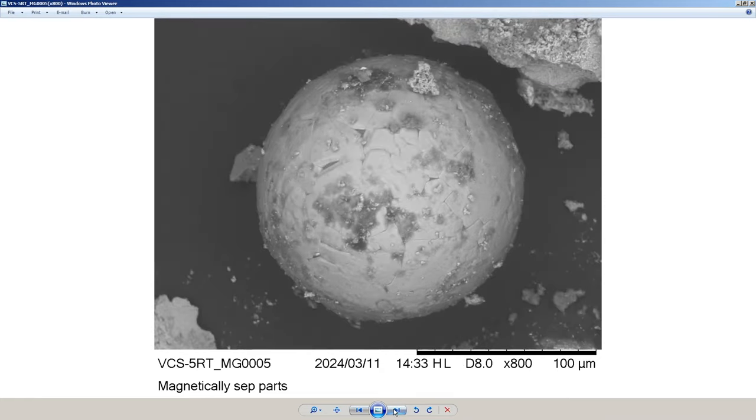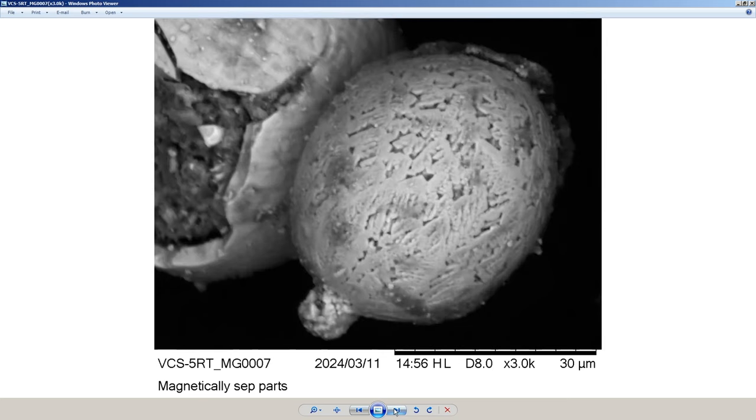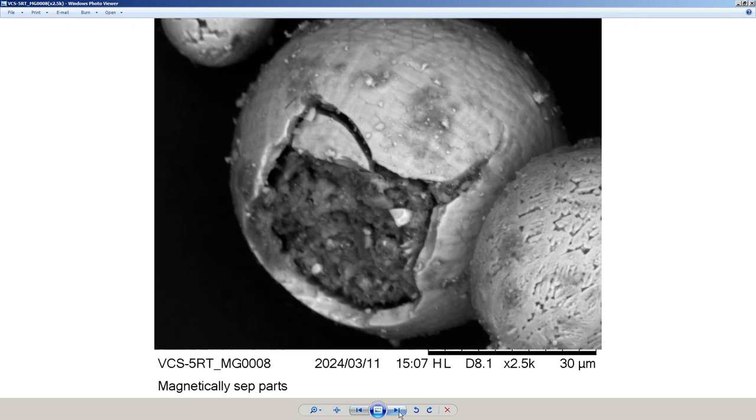Yeah, yeah. And in this one it starts to become really clear. But still, it's been affected. Got something deposited on this one very clearly. So this is 20 microns, that's 1 micron, so it's a big piece, isn't it? Yeah, this is 20 microns, but it's quite common. This one has the chromium in it, so you end up with these broken crystals. But you see how it's got these kind of ring-like sections? Similar to the bit that you analyzed.